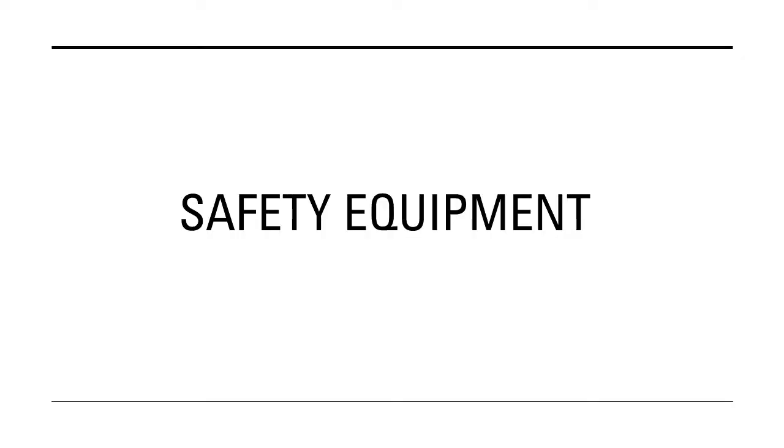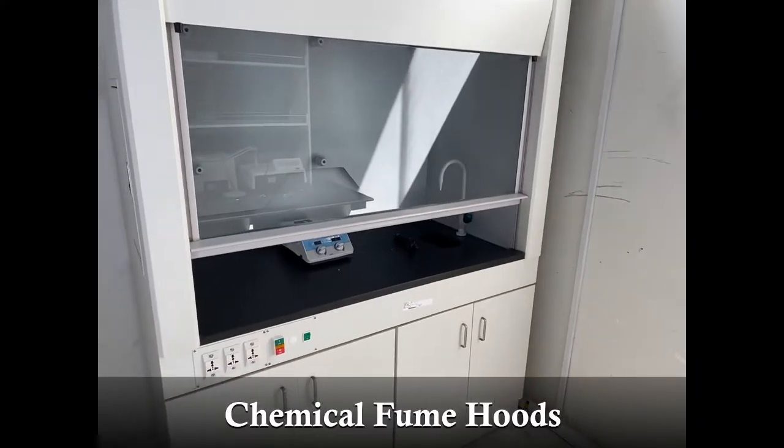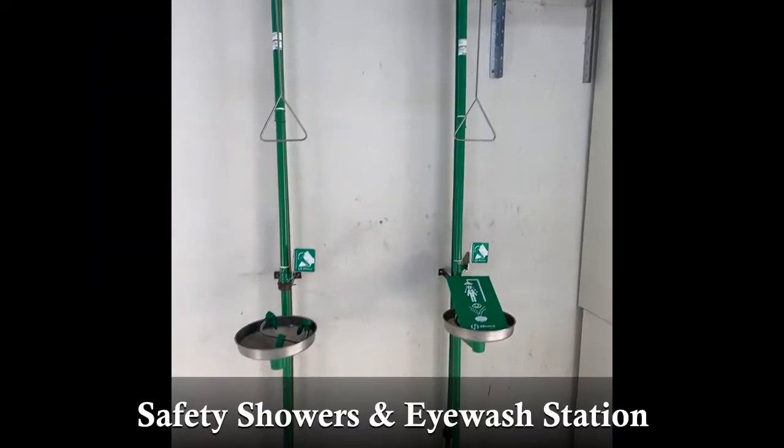We cannot forget to mention the safety equipment. These are the chemical fume hoods, the safety showers, and eyewash stations.